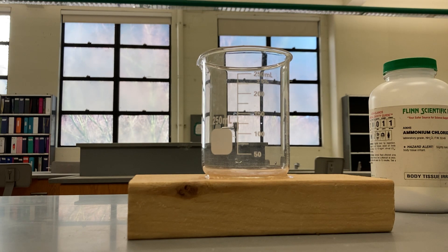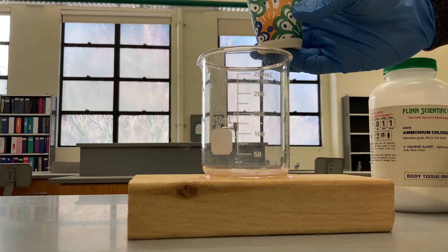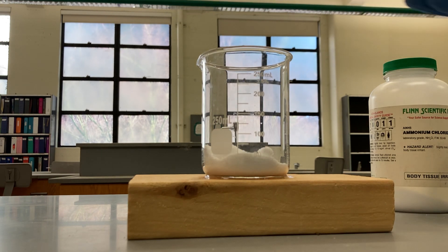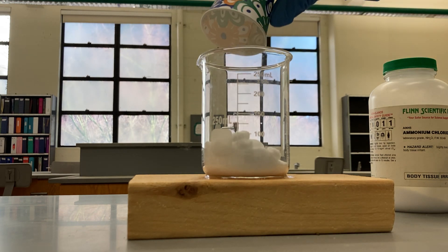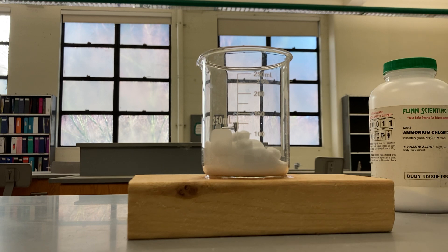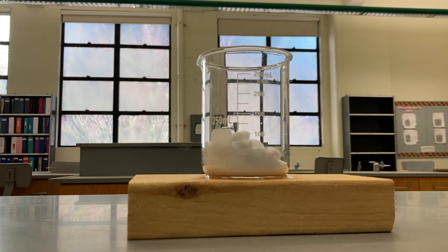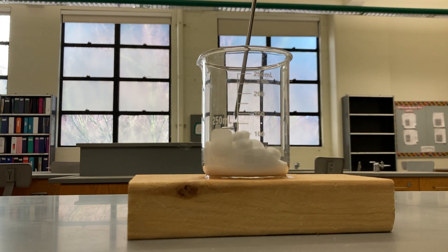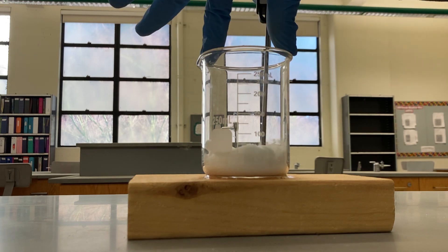Now I'm going to add the two reactants. Here's the barium hydroxide — sorry, this is barium hydroxide — it's going in. And then here is the ammonium chloride. Now I'm going to mix them using a thermometer.